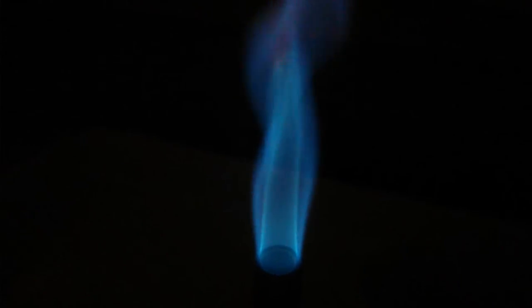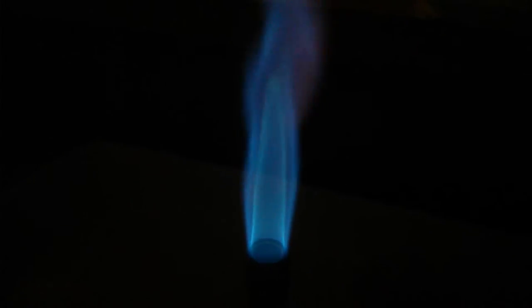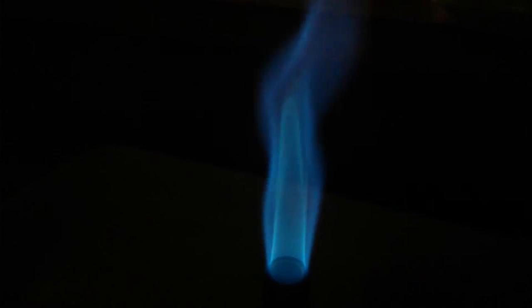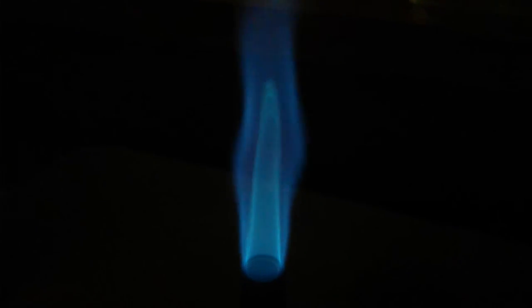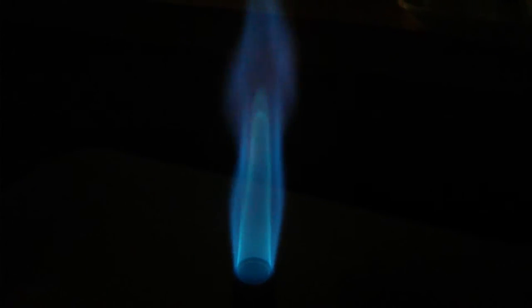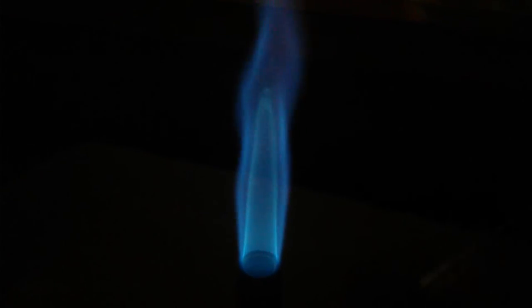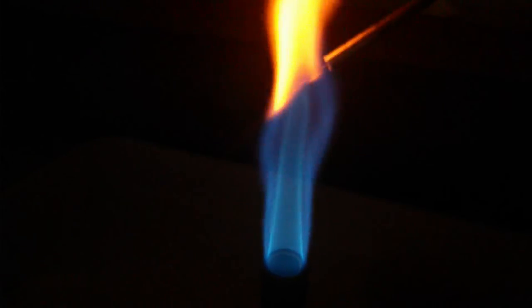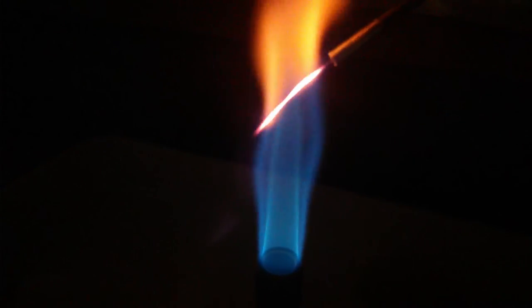Inside the flame you can observe kind of a smaller flame with a triangle. The tip of the triangle is going to be the hottest point in the flame.